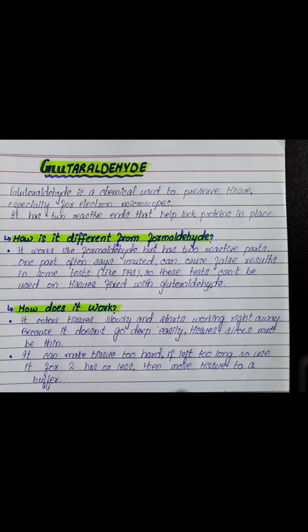The next one is, how does it work? As we know, it enters the tissue slowly and starts working right away. Because it does not go deeply, tissue slices must be thin. As we know, it can make tissues too hard if left too long, so use it for around 2 hours or less, then move the tissues to a buffer.